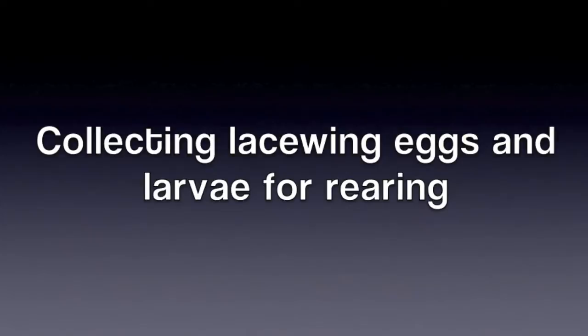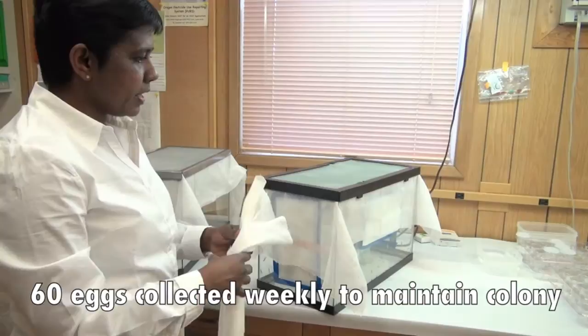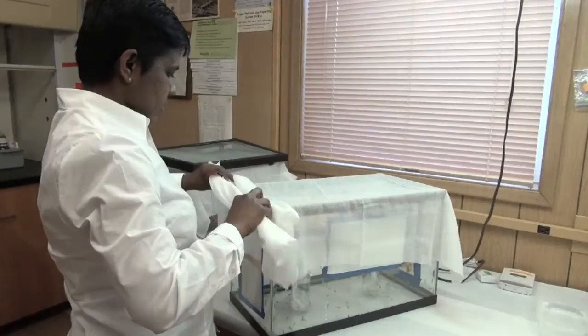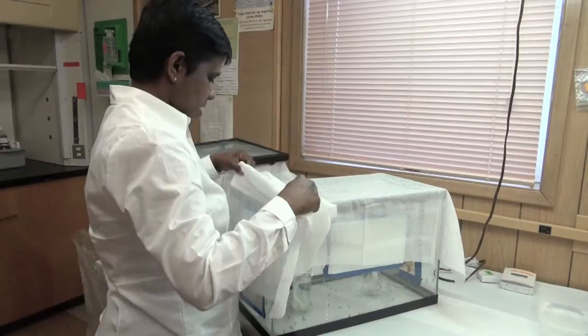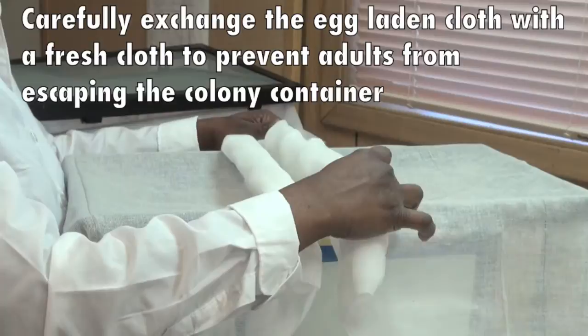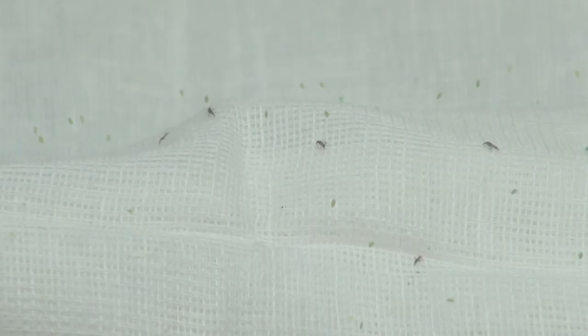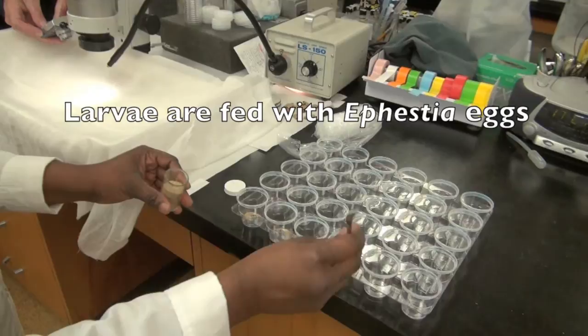Every week we collect 60 eggs for the colony. What we do is we have a piece of cheesecloth that we put in and remove the old cheesecloth. We have our cheesecloth here with eggs and we have our portion cups with paper strips. We normally put two labels: the day we collect the eggs and the day we are going to feed them.